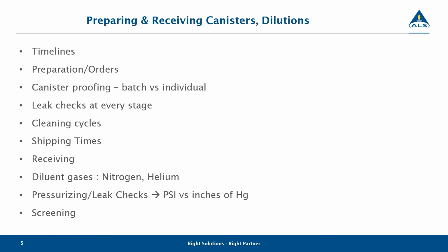Leak checks at every stage. I can't state this enough. And the reason that I do is because we often get clients who will say, well, did the canister leak on its way? Because now it looks like there's more sample in it than there was before, or less sample in it than there was before.